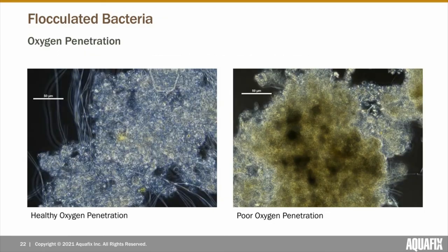We're able to analyze how well oxygen is penetrating flock by looking at their color using our phase contrast lens. When flock are white or tan, it's an indication that there are healthy levels of oxygen penetration. However, if flock appear darker brown or black, it's an indication of poor oxygen penetration, and septic regions will start to appear within the flock structure. If we see small flock that aren't very condensed but they are brown or black, it can be an indication that DO levels are too low, prohibiting sufficient oxygen penetration.